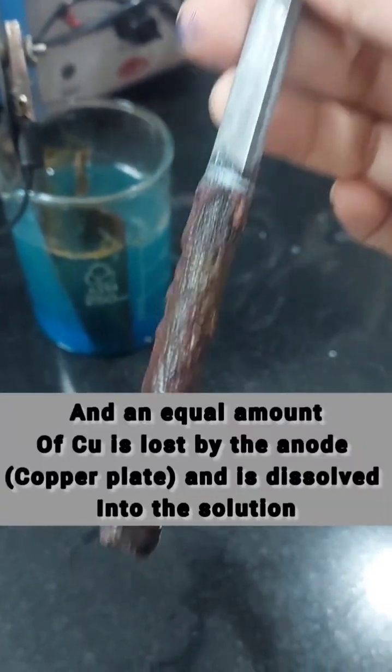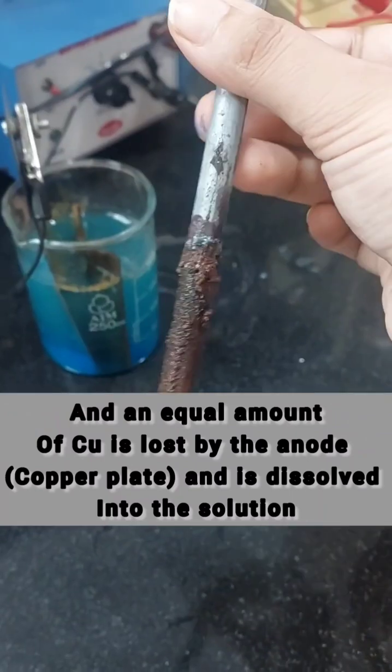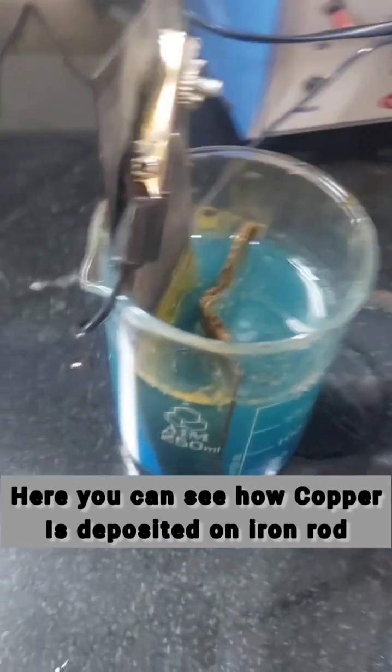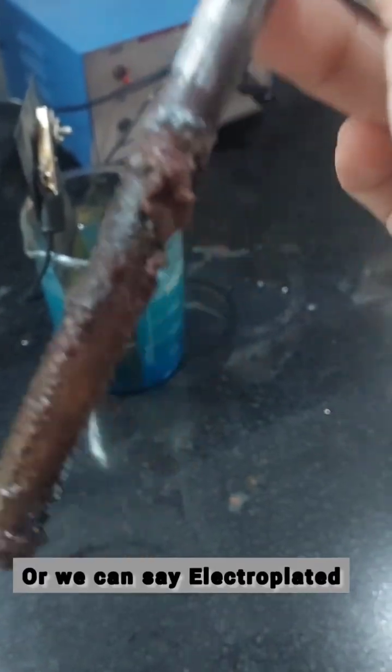An equal amount of copper is lost by the anode and is dissolved into the solution. Here you can see how copper is deposited on the iron rod. This is electroplating.